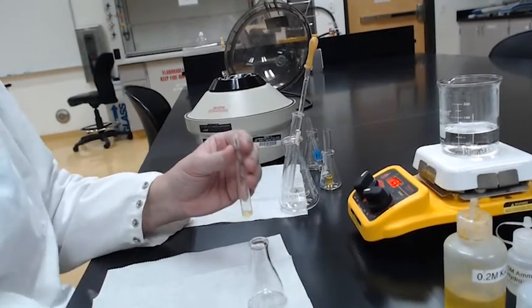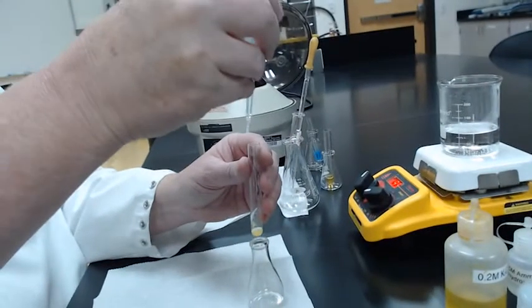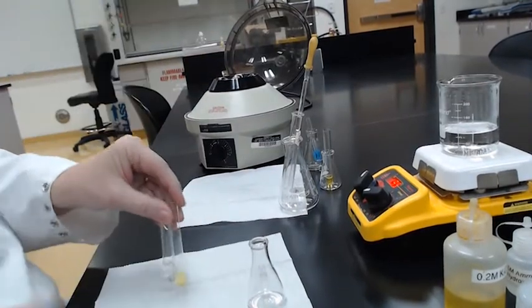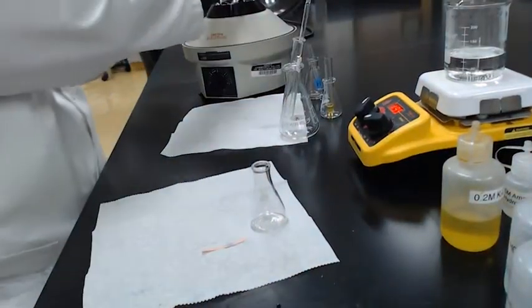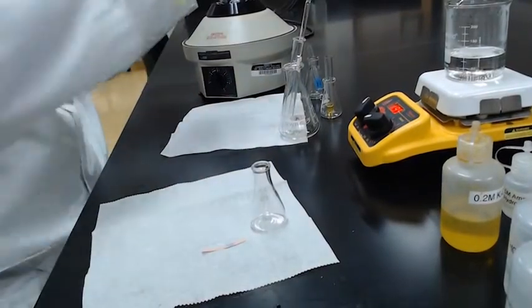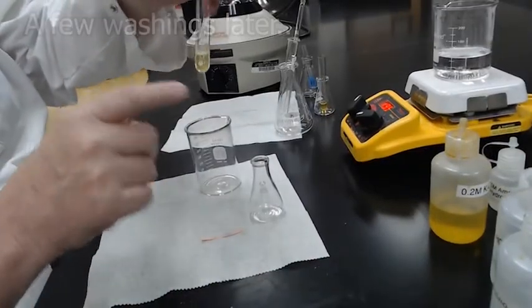Then the procedure says to wash the barium. The best way to wash the barium is actually to add some water and recentrifuge. Rinse it, add water, recentrifuge. So where's my balancing tube? We want to do a slightly better job balancing. So let's centrifuge again. Oh, and I forgot another trick. Shake it, then centrifuge.